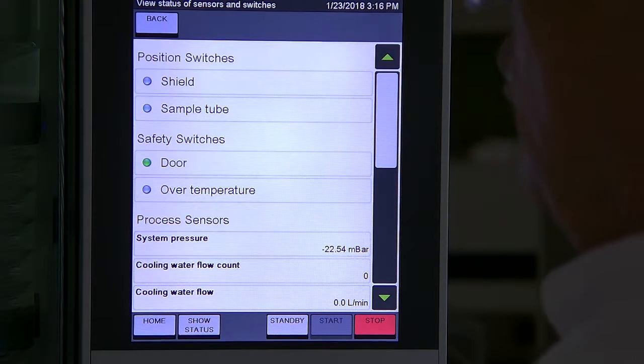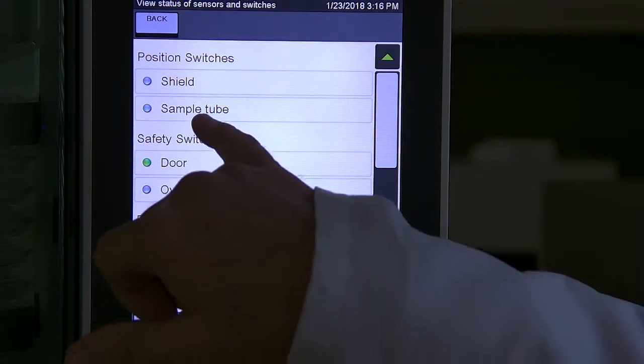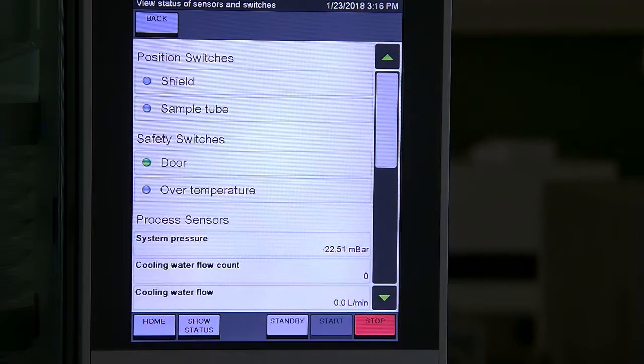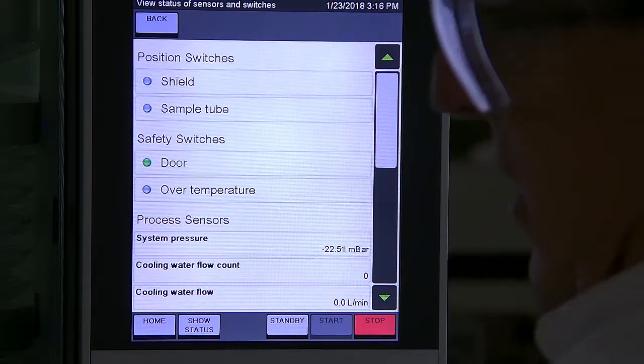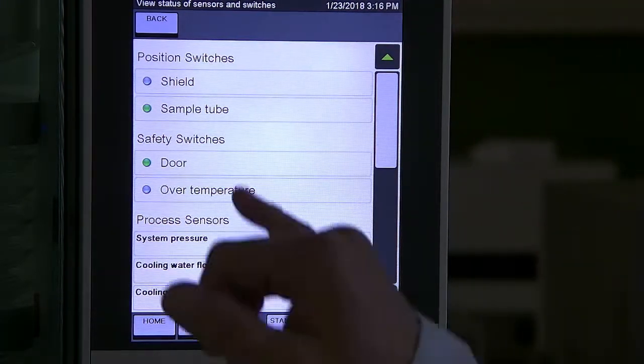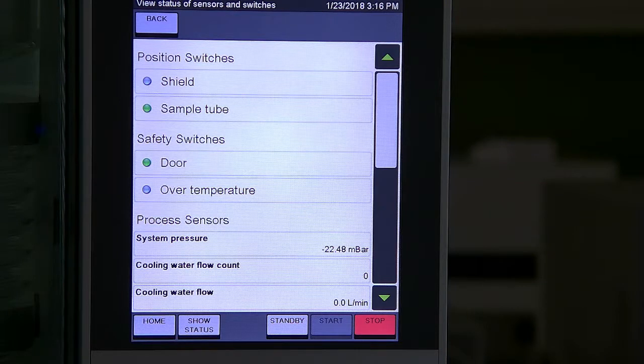If I take the sample tube off, the sample tube sensor has gone gray rather than green. We'll come back to the sample tube sensor in a few moments.